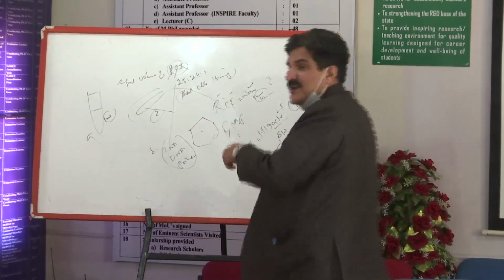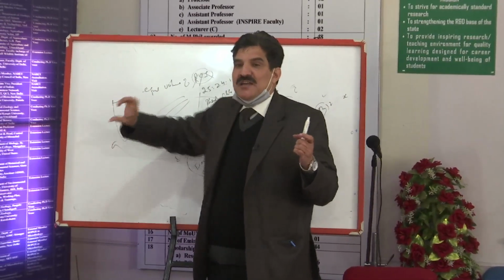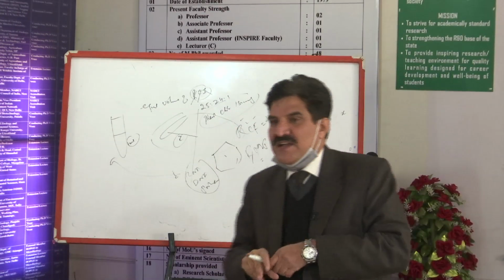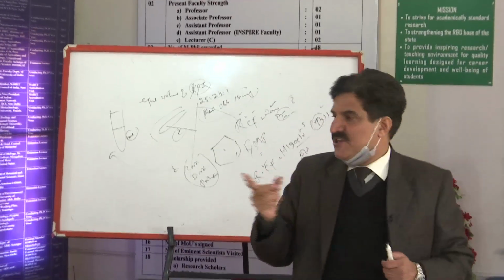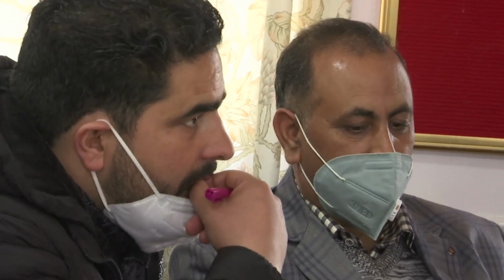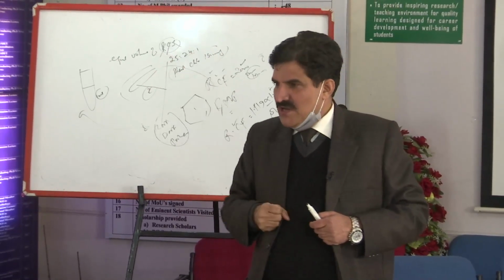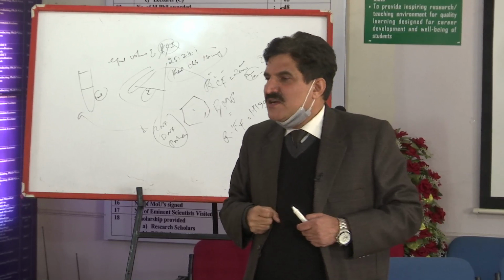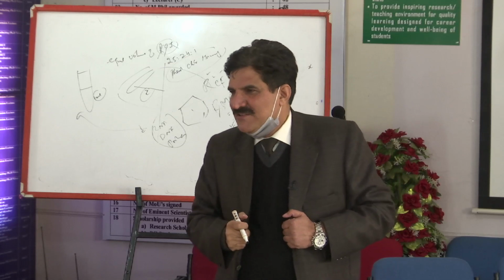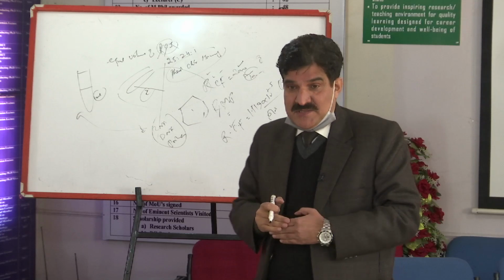So when you add an equal volume of PCI, you have to mix it. You can use a shaker, or you can slowly invert it like this for some time, even half an hour, it is up to you, so that proper separation takes place.